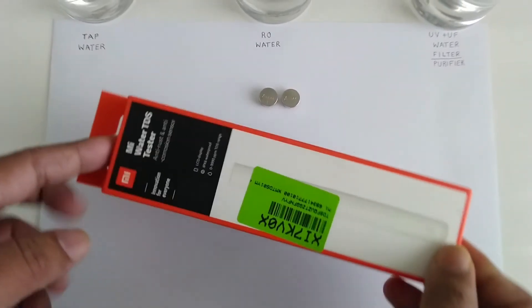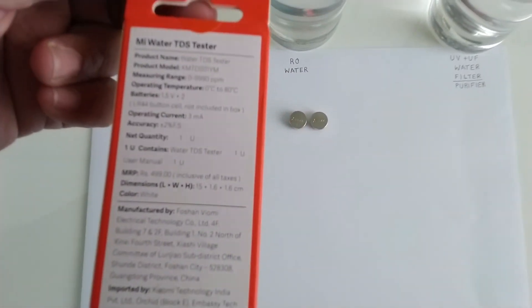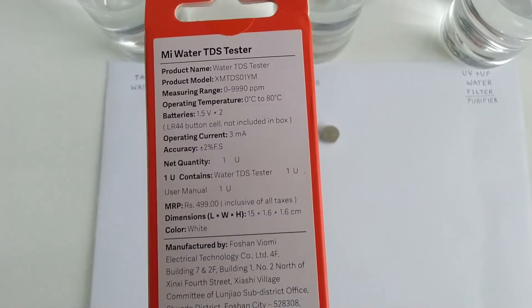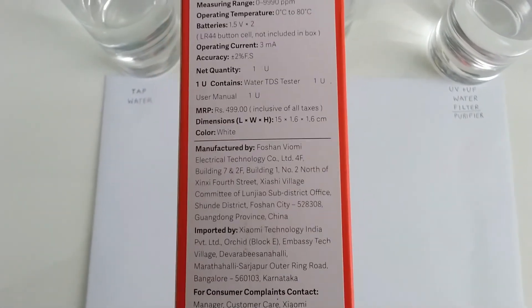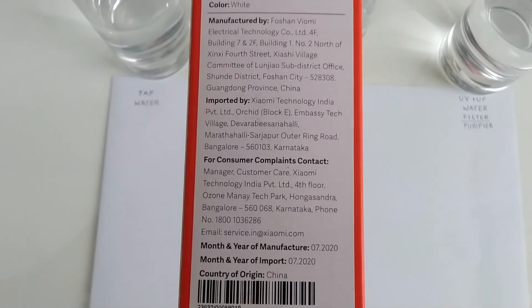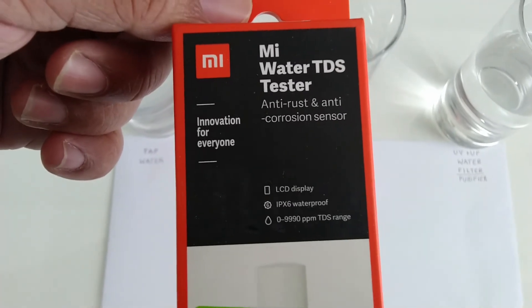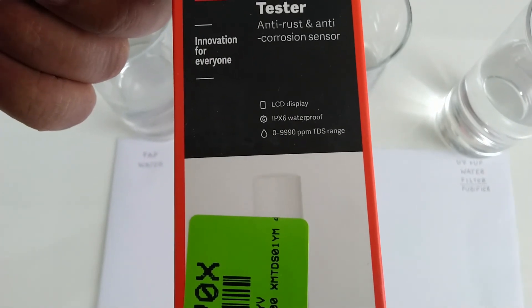Let's see what's on the box. You can see the model number, two batteries which are not included. The MRP is 499 but I got it for around 370. It is manufactured in China. On the front side it shows an anti-corrosion sensor that can measure from 0 to 9990 ppm.